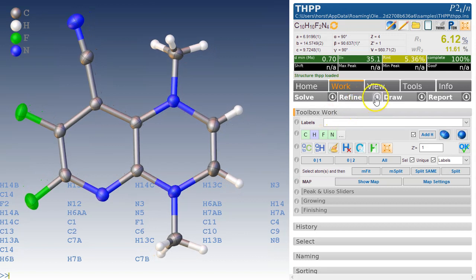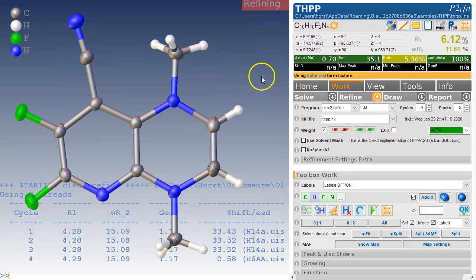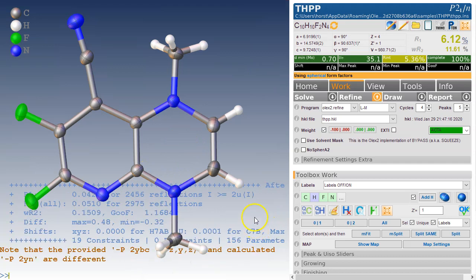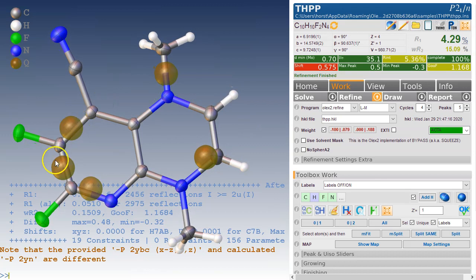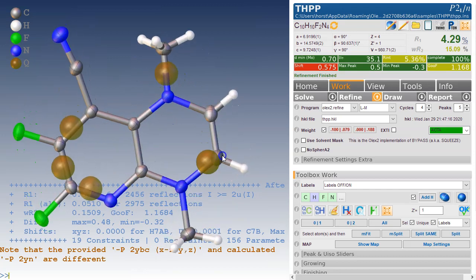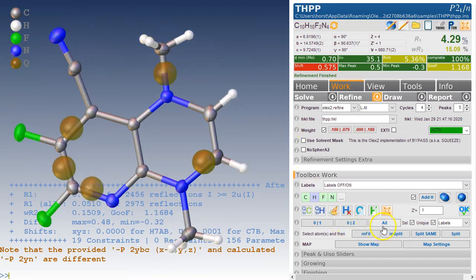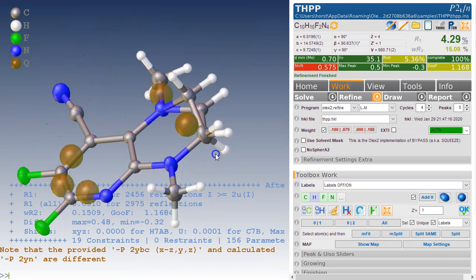Okay, so first of all let's refine this. We can set the refinement settings, we're going to use OLEX2 refine, and we hit the refine button. The refinement will start in the background and this will also give us some key peaks, electron density peaks, that we can look at by clicking on this button here. What we will see is that some of these peaks are on the bonds and some are not, this one here in particular. It's not a very strong peak, it's only 0.48, and this is why we have always modeled it this particular way, thinking that there could be another position of the carbon but it's a very weak peak.